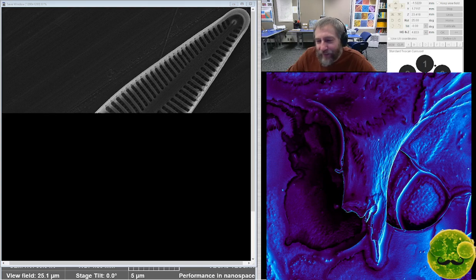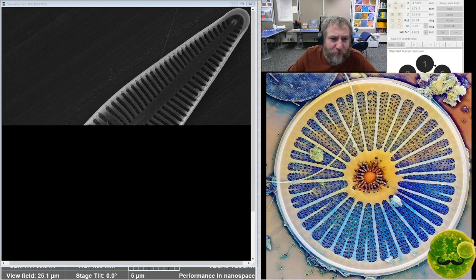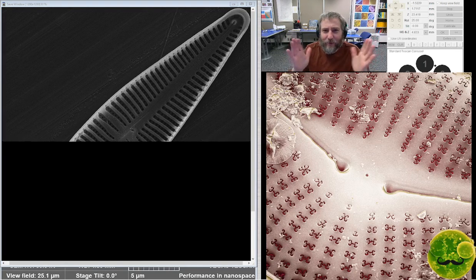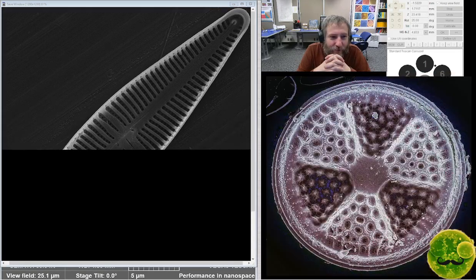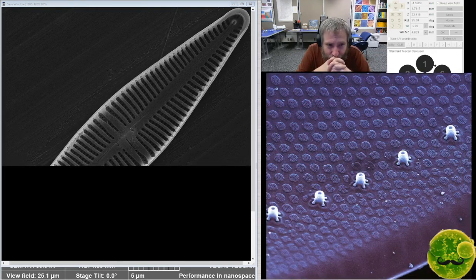This could be related to the Gompho monster, actually. This is from Africa, not Idaho. But this diatom is very weird. It is somewhere between Gomphonema and Afrocymbella. It's somewhere on that spectrum. I previously was sort of convinced that it was Afrocymbella tanganyikae, but subsequently, I'm not convinced that that's what it is.